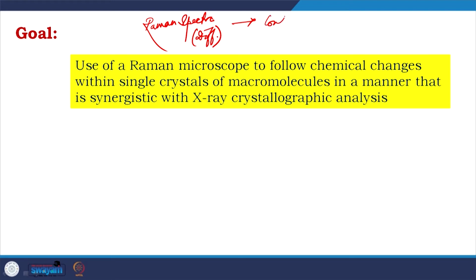We are using confocal, so that we lock in Z of the crystal. We are using the protein crystal as a platform of the experimental setup. Raman spectroscopy, confocal and crystallography combined, we name this unique technique Raman crystallography.